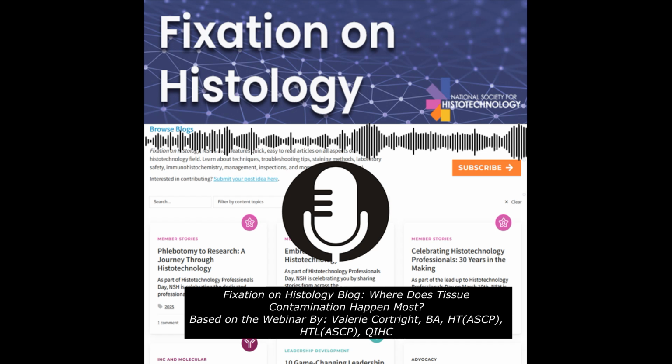Procedure rooms. The beginning of tissue contamination often takes place in a procedure room, long before histologists have the opportunity to handle a sample. In the clinics Cortright works with, she has observed errors that ensue because of many factors, including mistakes with container labeling, instrumentation reuse, and high patient volume.